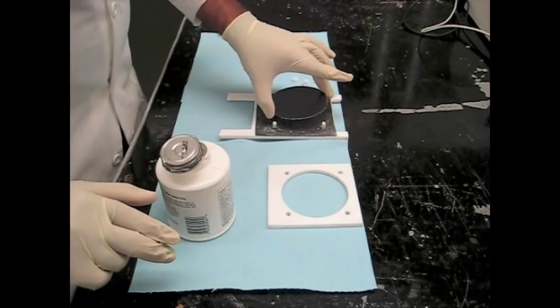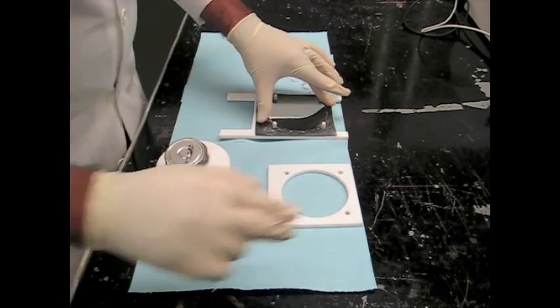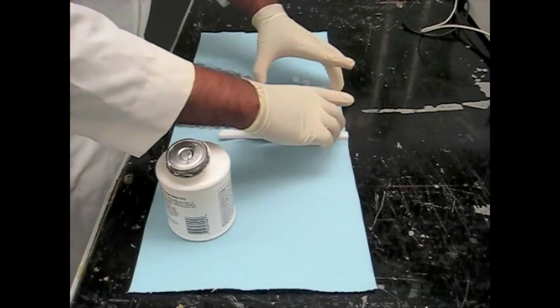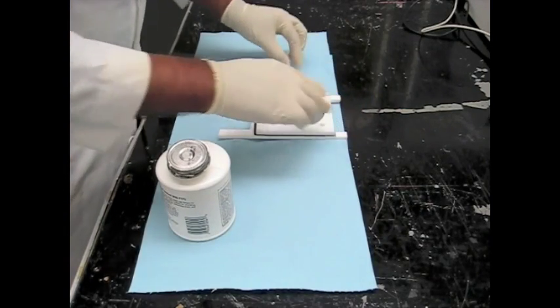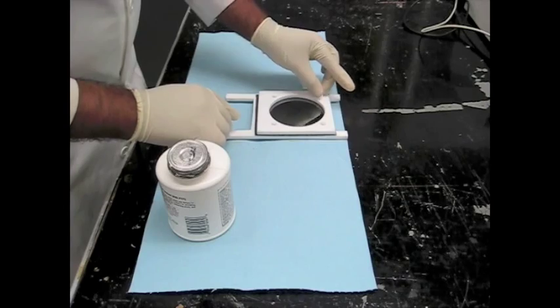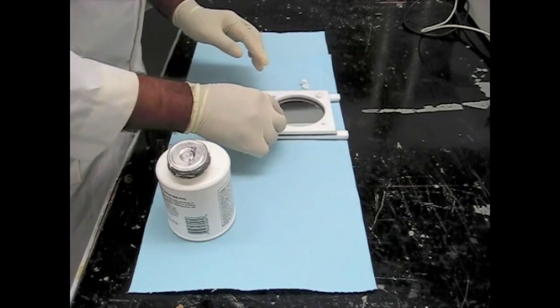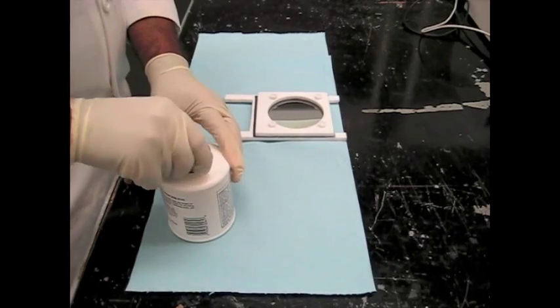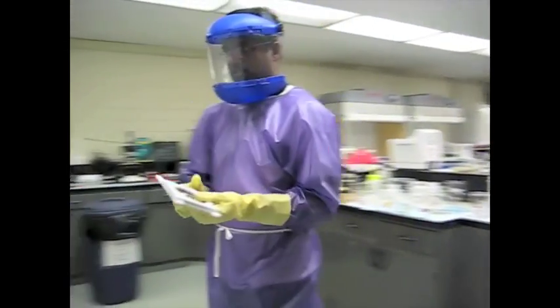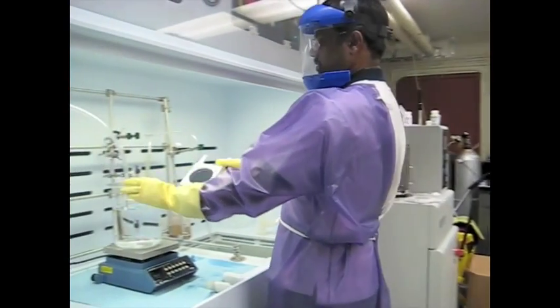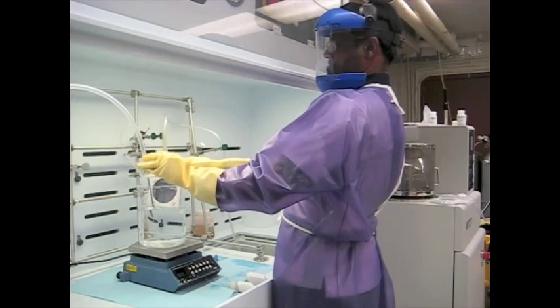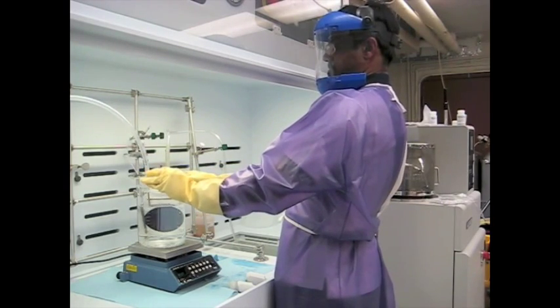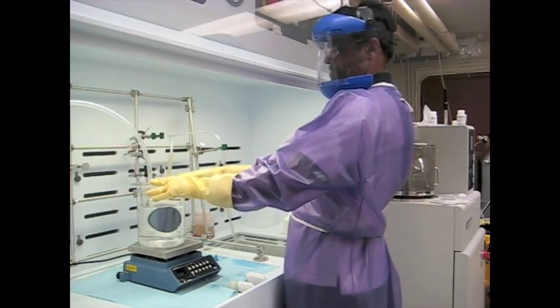Next, the wafer is mounted on a Teflon frame that holds it at an angle during the etching process. This frame also ensures safe handling of the sample wafer in a highly corrosive etchant solution. The frame containing the wafer is finally placed in the etchant. This etches the silicon wafer, leading to the formation of microchannels with a trapezoidal cross-section.